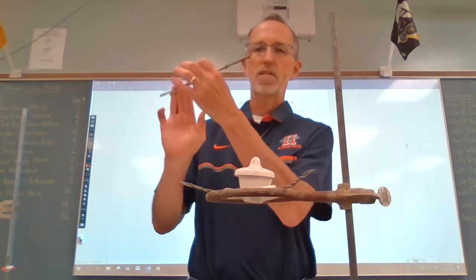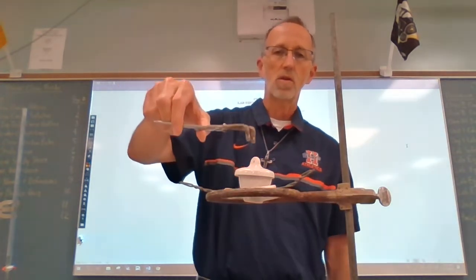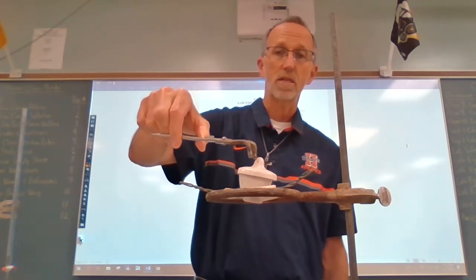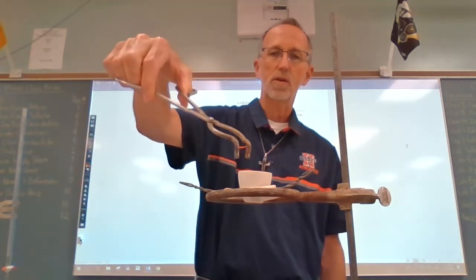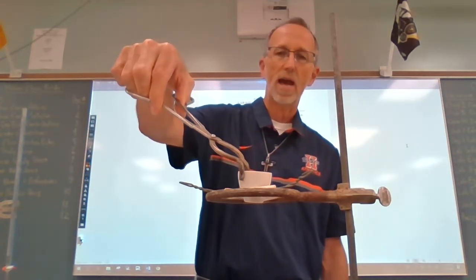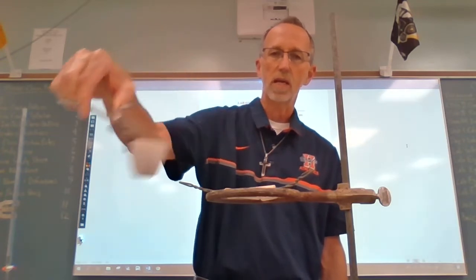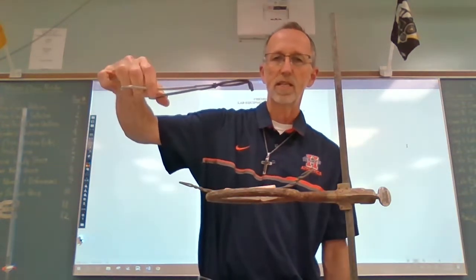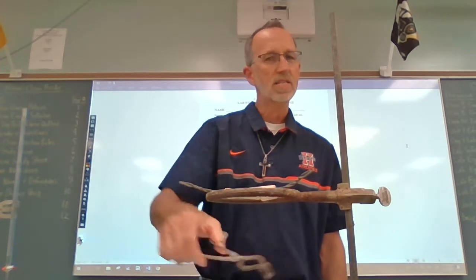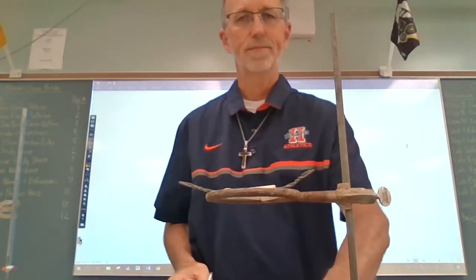hot. If you take your tongs and turn them around the other way where the ends are pointed down, you can simply grab the lid first, fairly easy, set it down, and then you can grab the crucible itself just by grabbing it on any of the edges, anywhere on there, pick it up and set it down as well. So pick it up together this way, pick them up separately this way, probably less likely to drop either of those doing it the second way, but that's up to you. Okay?